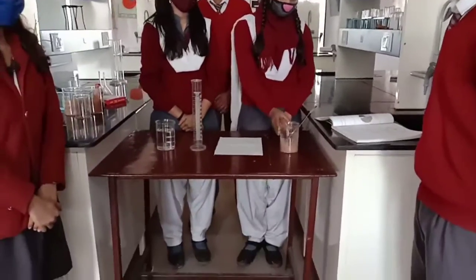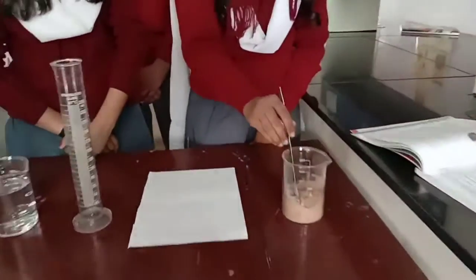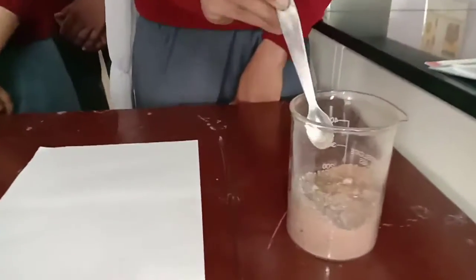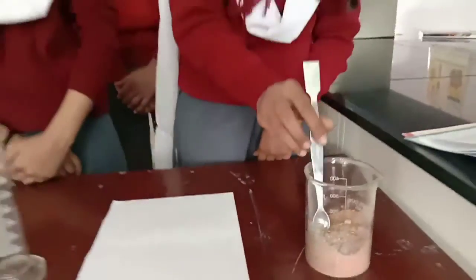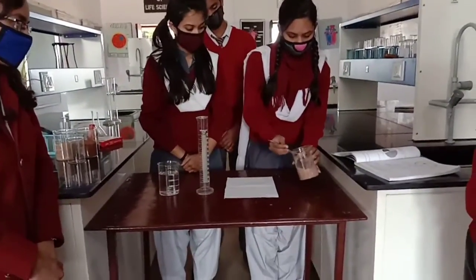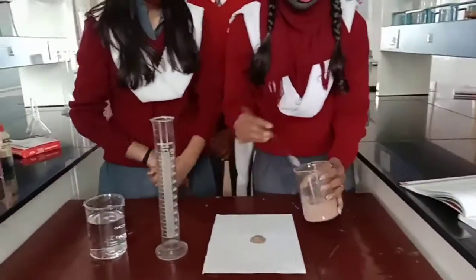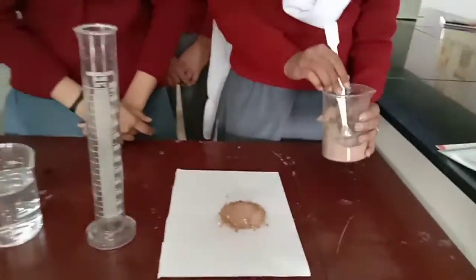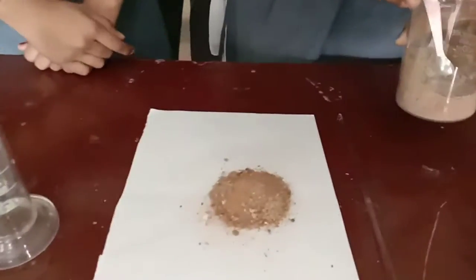We must know the principle. The soil texture is one of the most important physical characteristics of a soil, which is used to determine the type of soil based on its physical texture. The soil texture depends upon the proportion of the constituent particles of different size like sand, silt and clay.